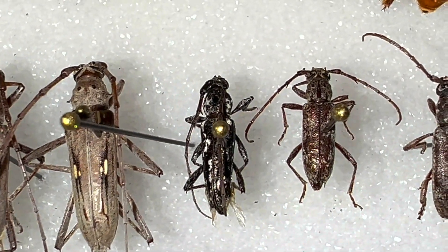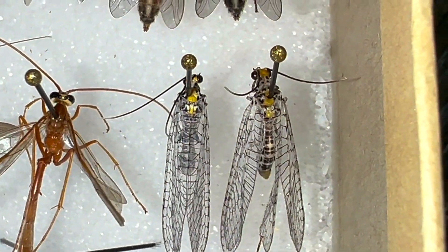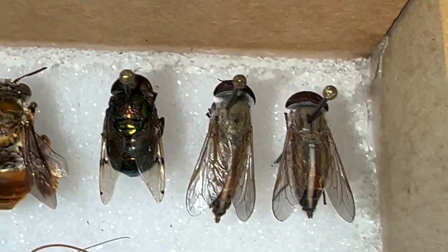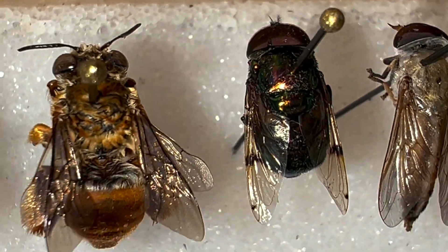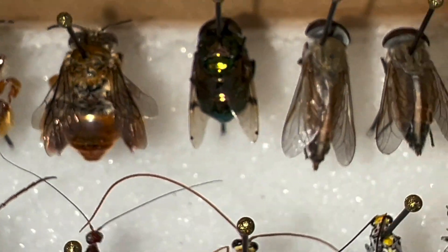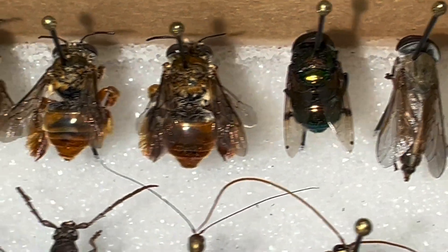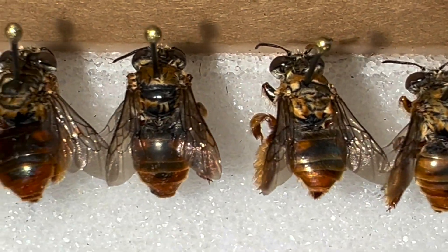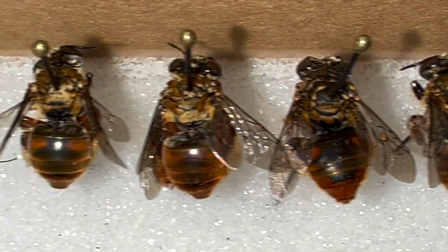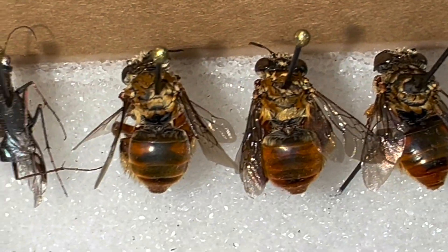We've got one of those guys and then a couple of these. We've got some caddisflies. This fly right here — the colors don't do it justice now, but they're iridescent green. Pretty cool. And then there are these bees right here. These bees are kind of interesting to me. Looking forward to seeing what those guys turn out to be.